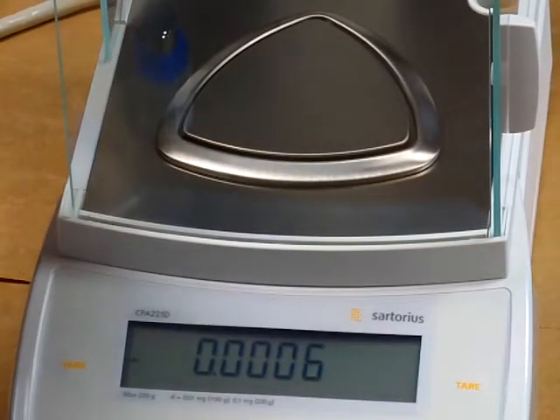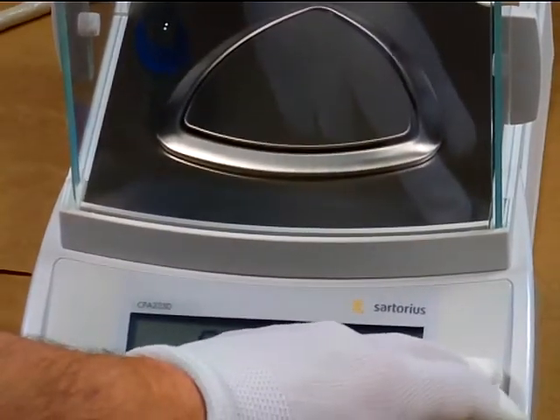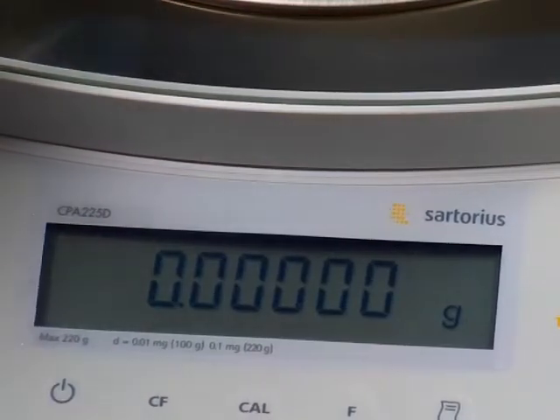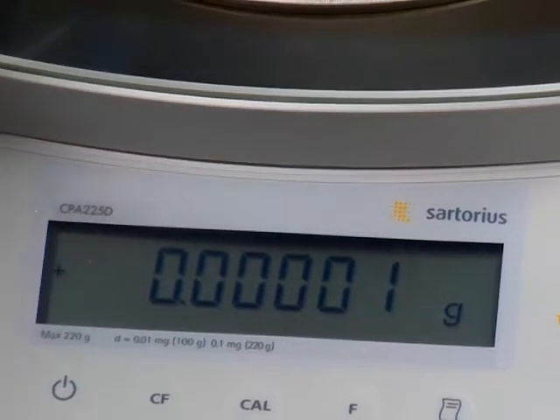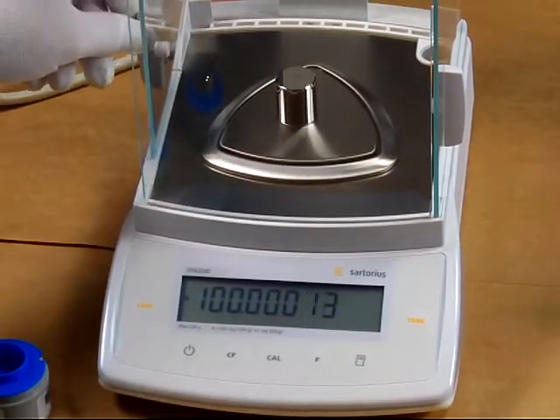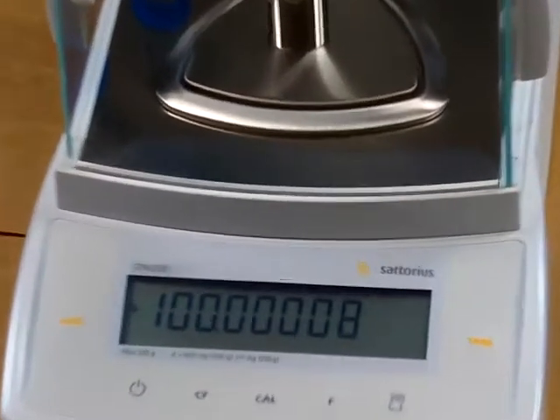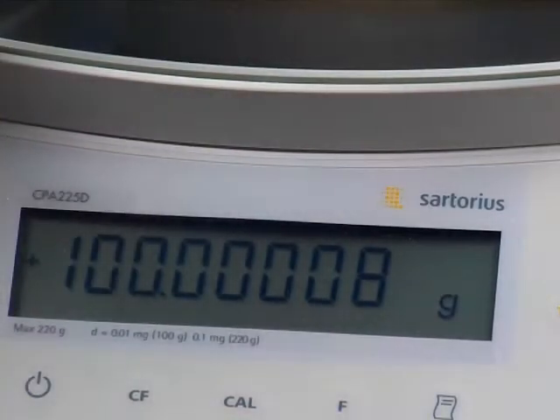We'll tear the balance, and now we have 5 decimal places. We'll put a 100 gram test weight on. And there you go — 5 decimal places.